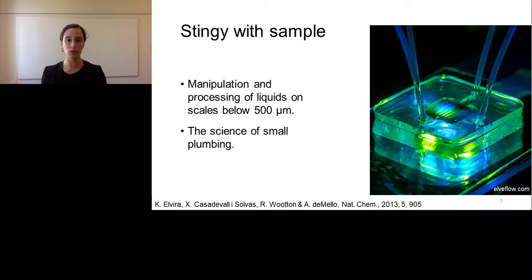A really good way of thinking about this, if you're not a microfluidics researcher, is to think back to your days in the chemistry lab, or a biology lab. I used to do chemistry or biology in round bottom flasks, or I used to do biology in 96 well plates. Well, we're doing the same idea, but instead of using our hands to manipulate fluids to do reactions, we're using a microfluidic device to do that manipulation.